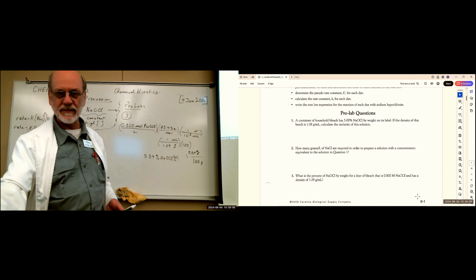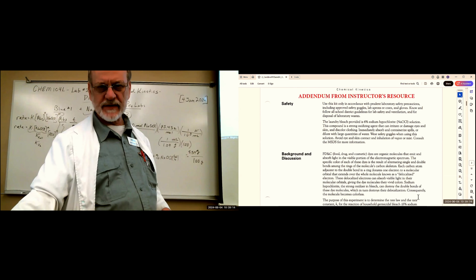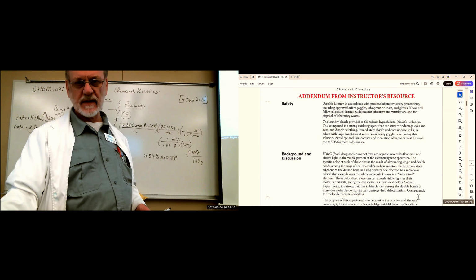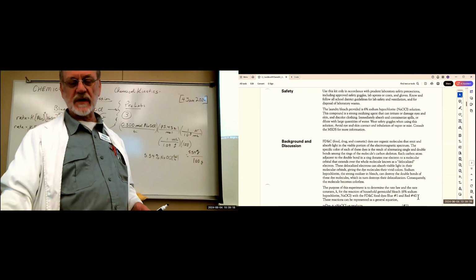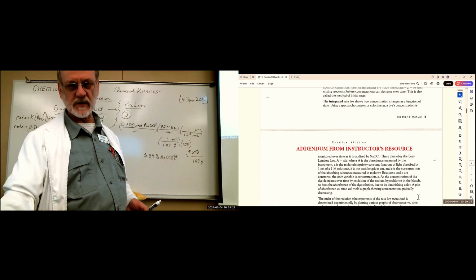Okay. So those are the pre-lab questions. Let's see. Oh, 6%. I think we're using 6% hypochlorite. We are. Yeah, 6%.